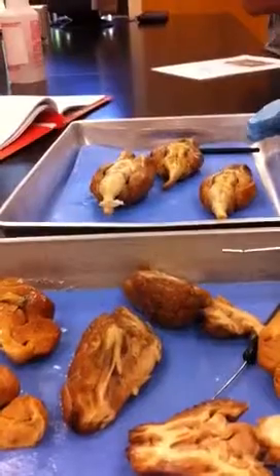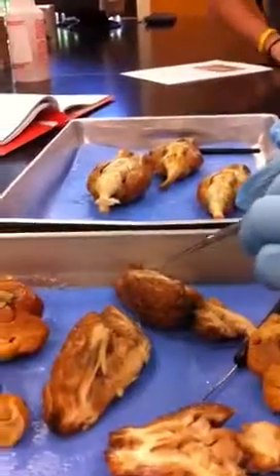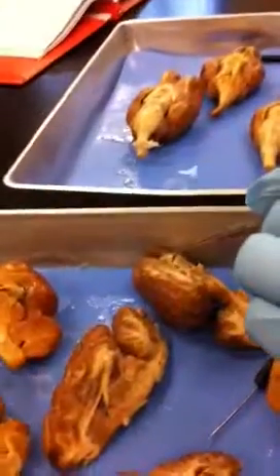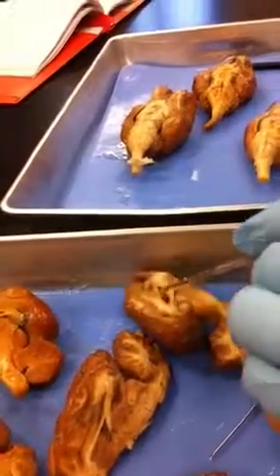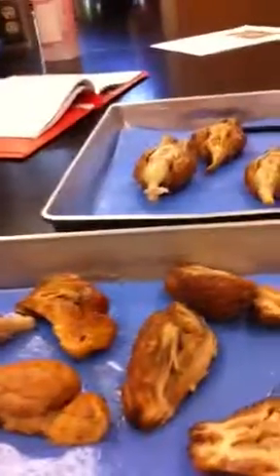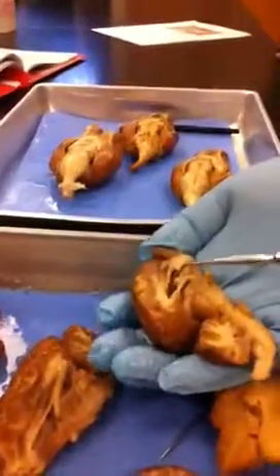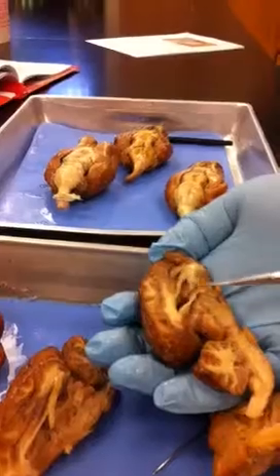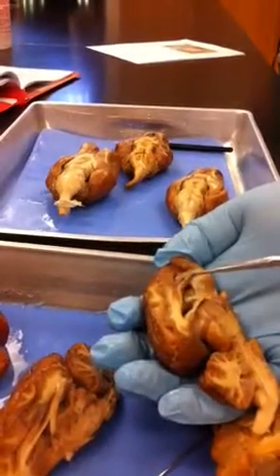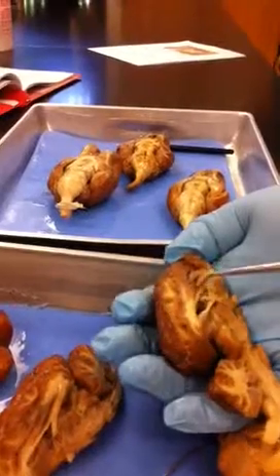Okay, so corpus callosum, remember that was the roof of the lateral ventricle. So that's this white part right here. See this white part of the lateral ventricle right there, forming the roof. Which one? Can you turn that over and show us? Sure. This space is the lateral ventricle, and the roof of the lateral ventricle right here is the corpus callosum.